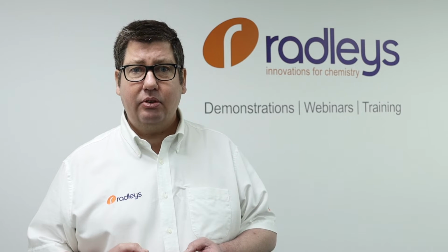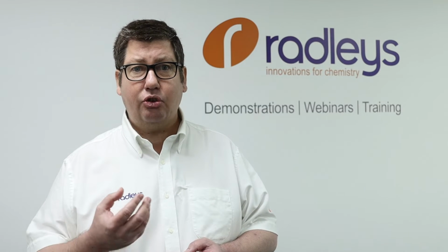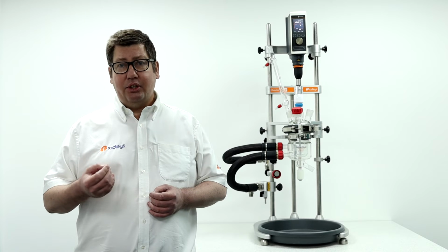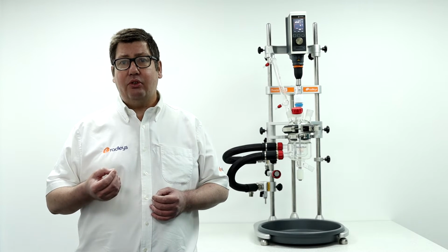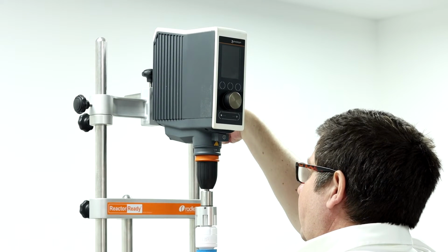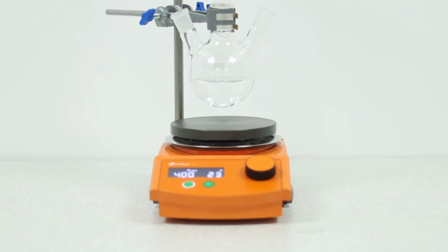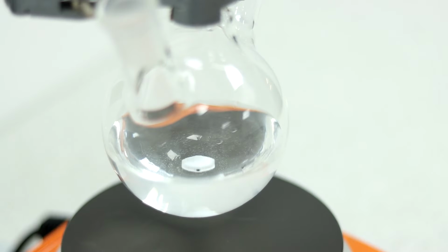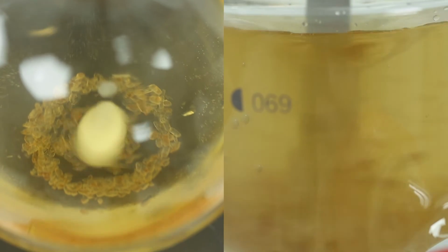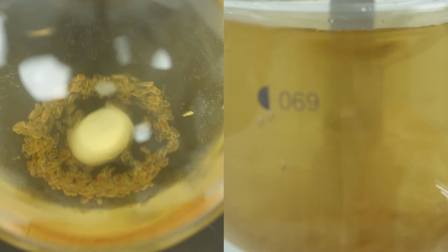Any misalignment might lead to vibration, putting a stress on the glassware and potential breakage. There are newer systems available which overcome the traditional issues of stirrer misalignment through use of a drop-in coupling. Using a magnetic stirrer and stirrer bar in a round bottom flask will give different stirring characteristics compared with overhead stirred systems as is used on larger batch scale.